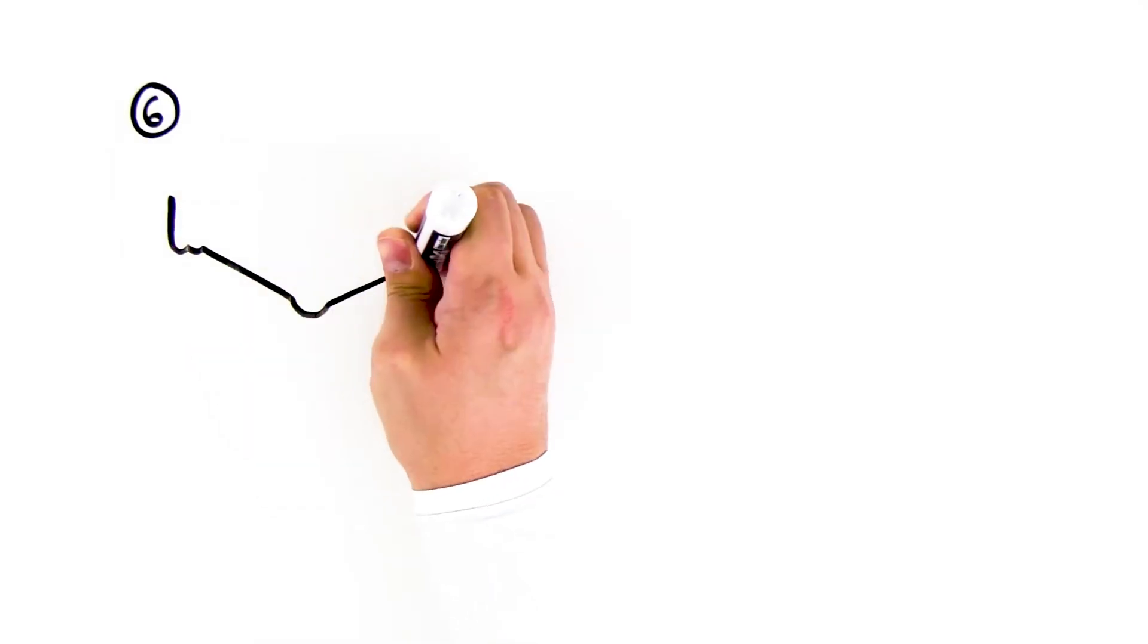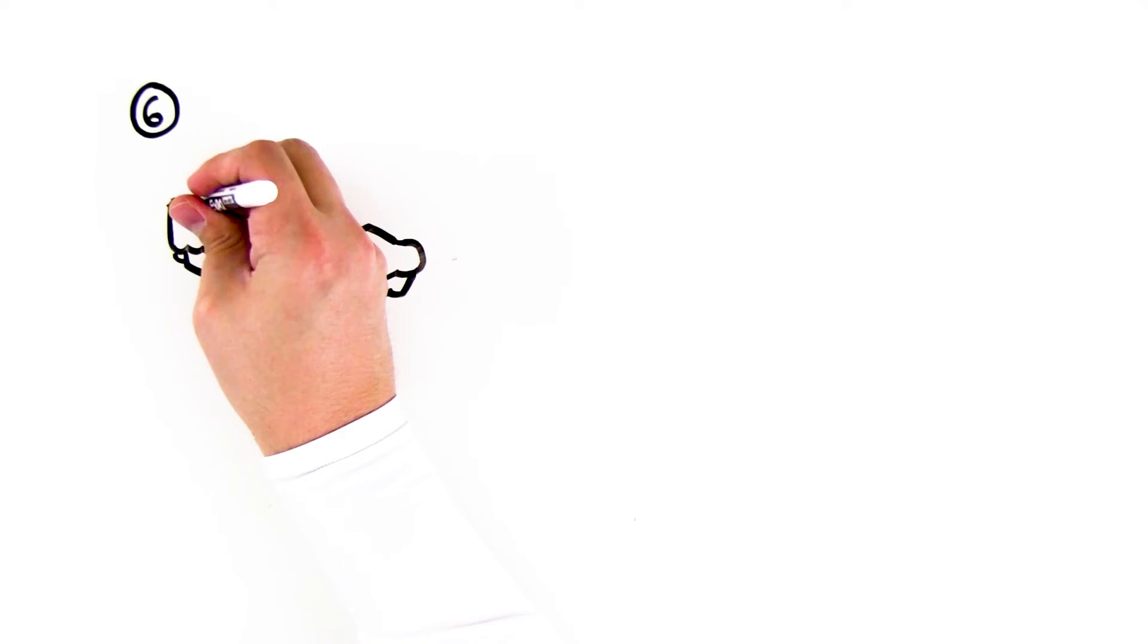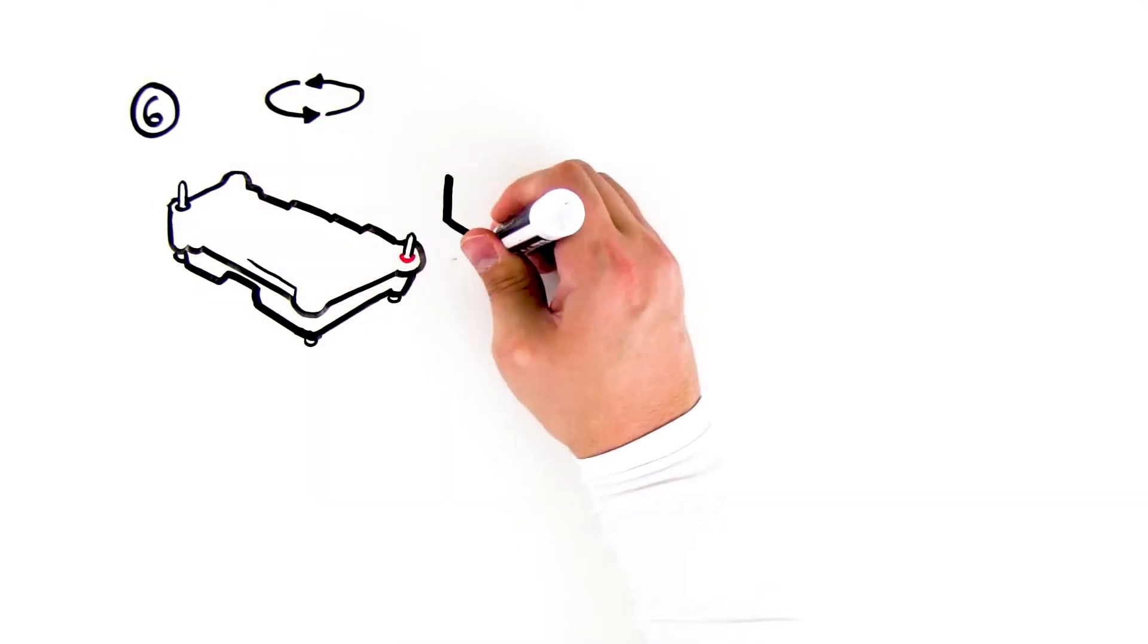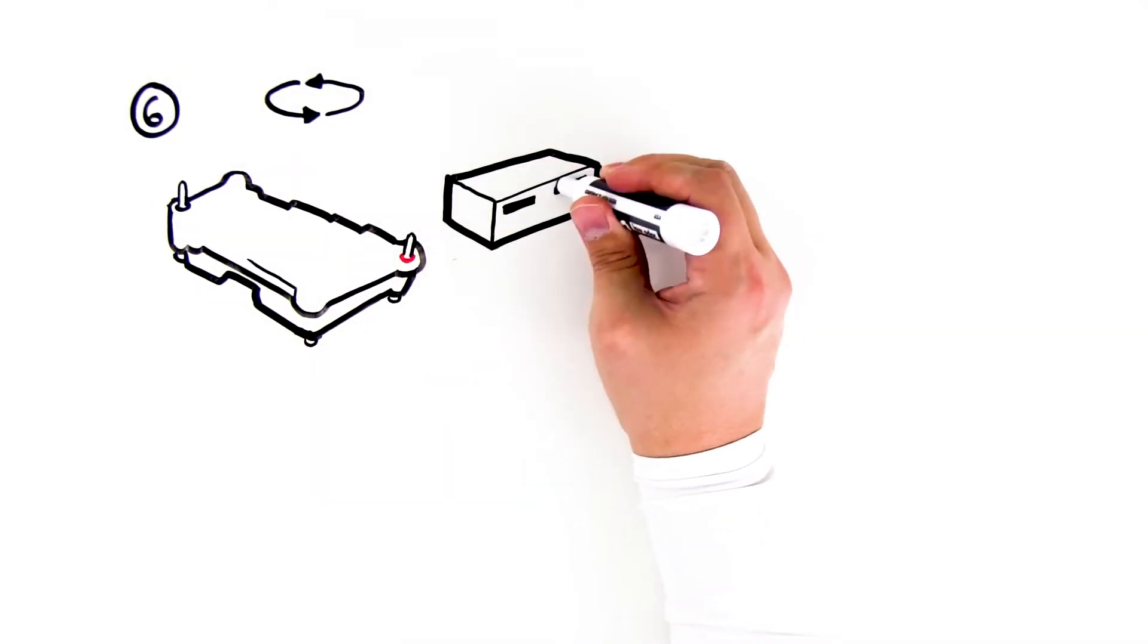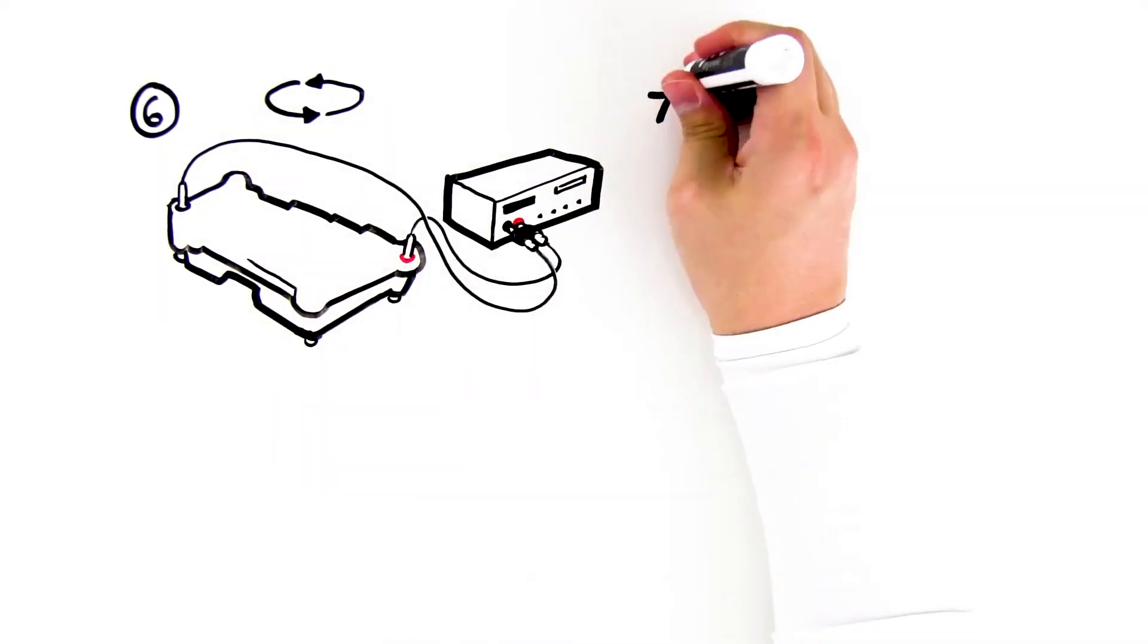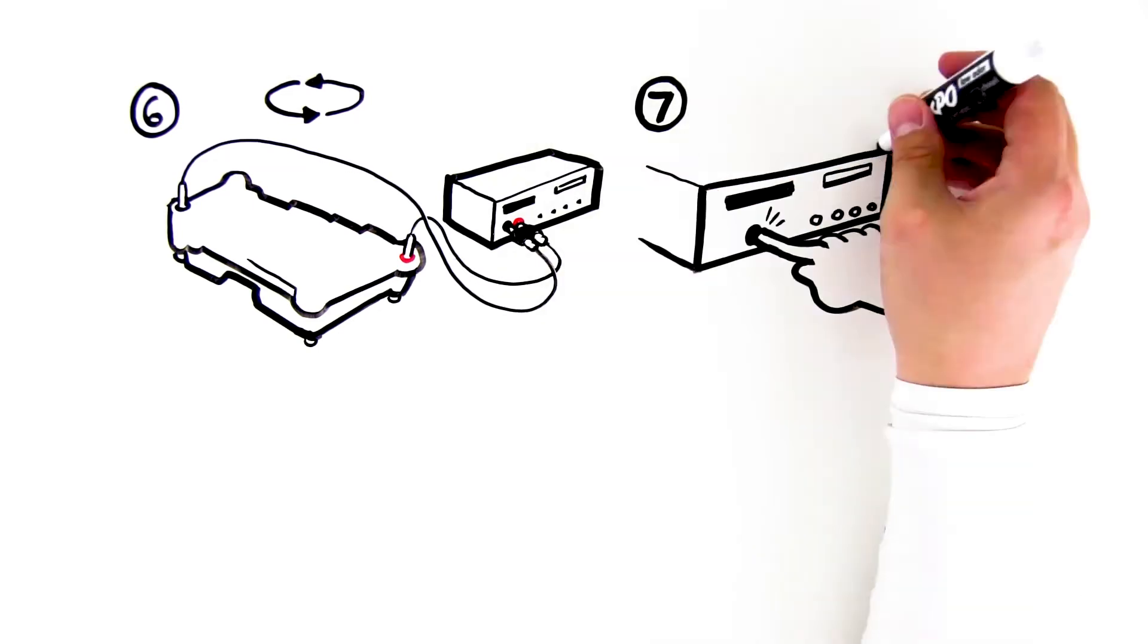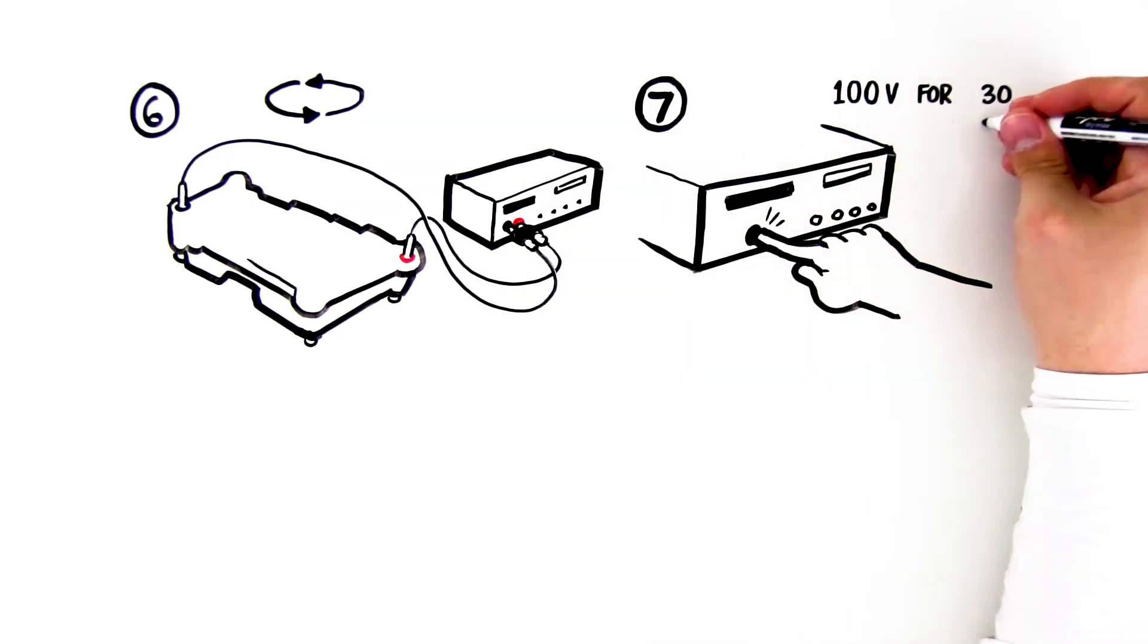Sixth, place the lid on the electrophoresis chamber. The lid will attach to the base in only one orientation. The red and black jacks on the lid will match with the red and black jacks on the base. Plug the electrodes into the power supply. Seventh, turn on the power and electrophoresis your samples at 100 volts for 30 minutes.